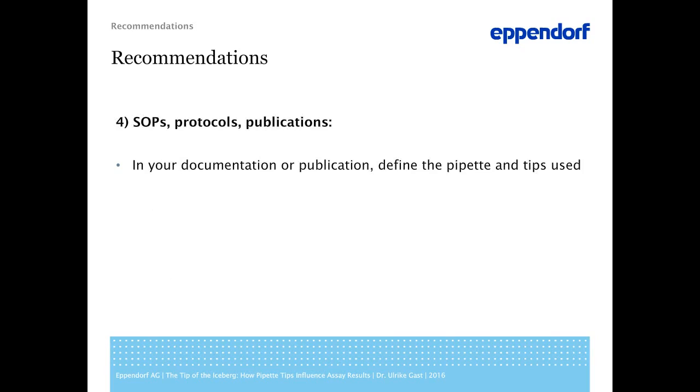If you look through the literature, only very few publications define the pipette and pipette tips used. This is due to the common understanding that pipettes and tips are general lab tools with minor influence on the analysis results. However, as shown here, this is only true for pipettes and tips of one manufacturer. In case of utilizing alternative tips, the system's performance may be impaired.